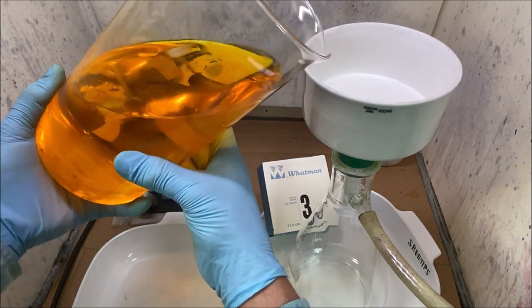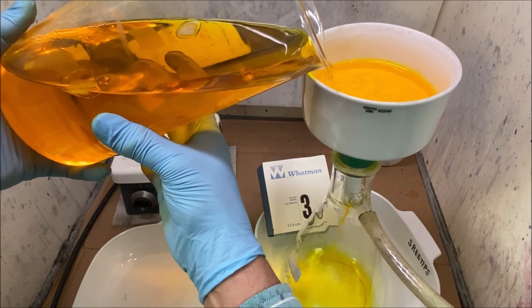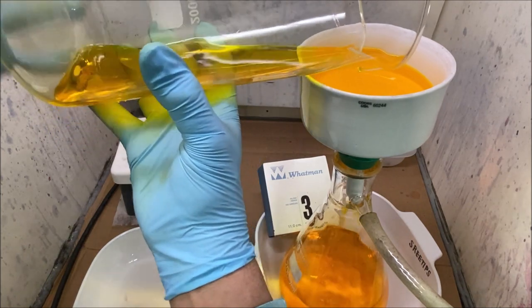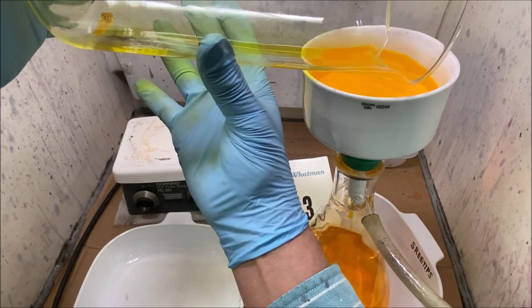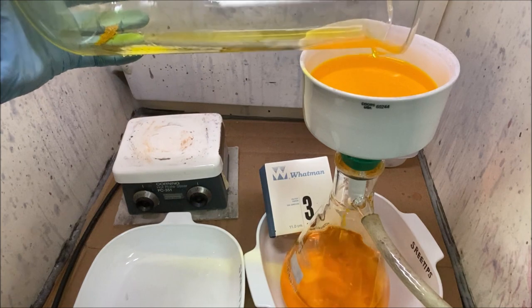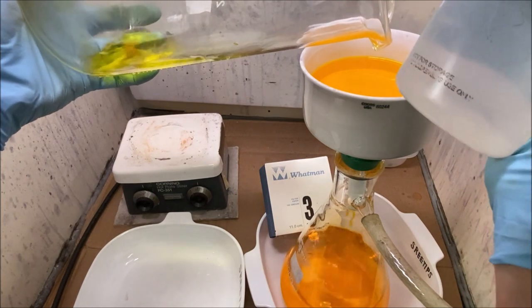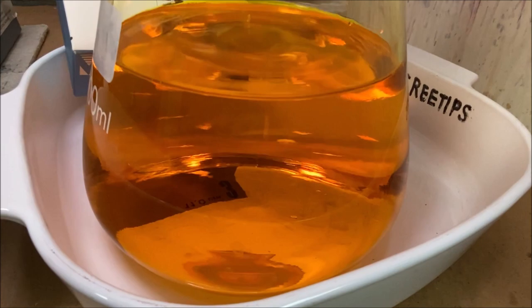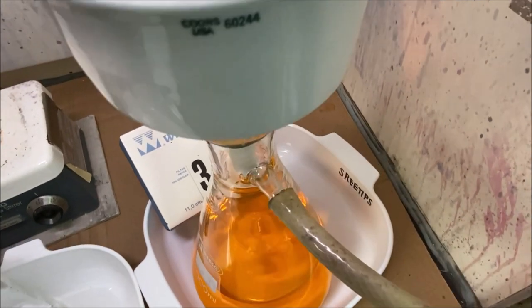Got just a touch of cloudiness, so we can get that out of there by pouring it through one of these filters. Here you're able to see the few little pieces of gold that were left in the bottom of the beaker, undissolved. And what we'll do is we'll get that out of there and add that to the waste container and recover it later. Now that is a crystal clear solution with no traces of cloudiness. It's gonna be some high purity gold right there.